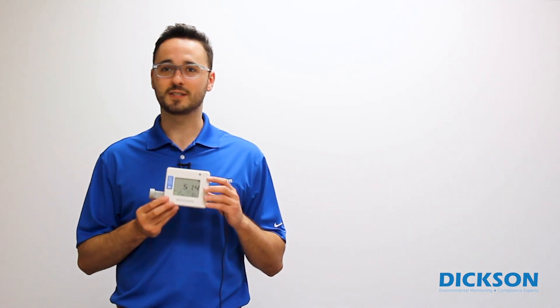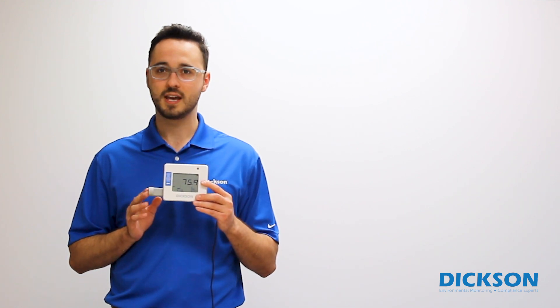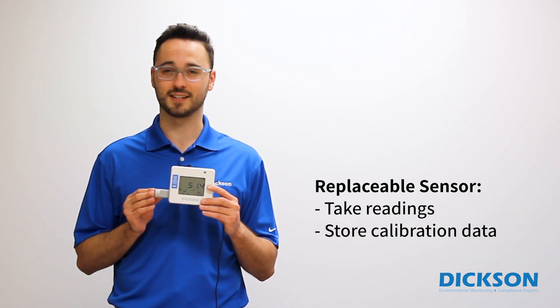Replaceable sensors simplify the calibration process by separating the sensor portion of your data logger from the brain of the device where the data is stored. This is our basic Dickson One data logger, and it features a replaceable sensor. This piece is the replaceable sensor, which contains components that take the actual readings and store the calibration settings.